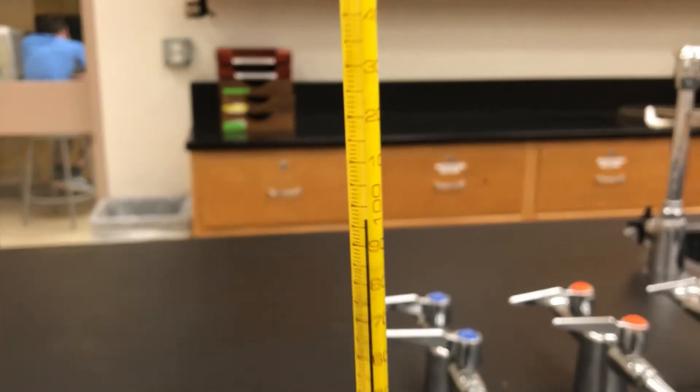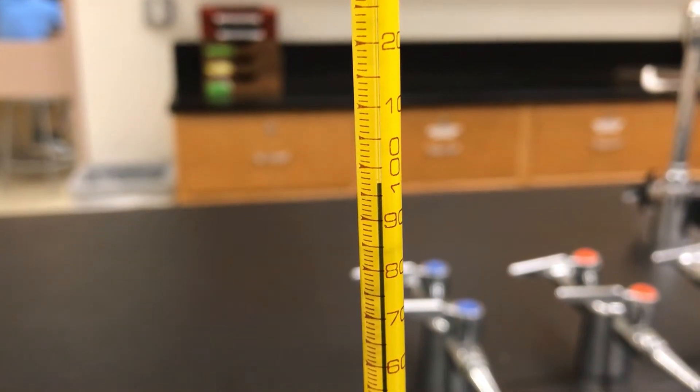I'll try my best to zoom in and show you what you can see through the eyepiece. In the middle slot you can see the solid inside the tube. The thermometer is touching a metal block that is surrounding the sample, so it's measuring the temperature of your solid.